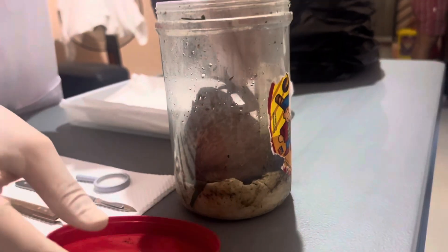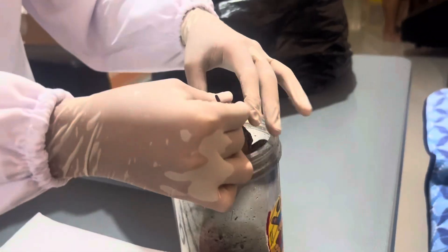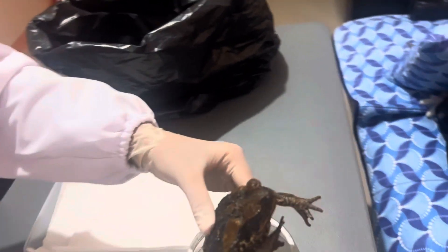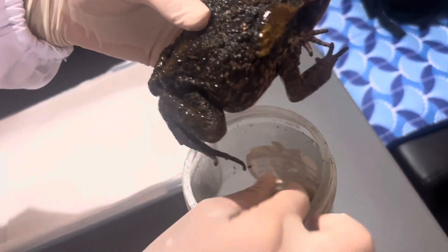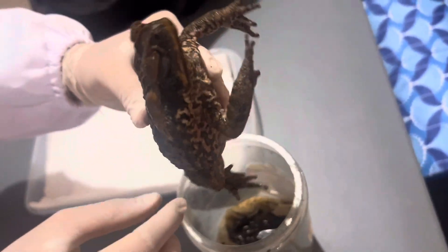In order to make the toad unconscious and dizzy, we poured alcohol. Meanwhile, there were hilarious moments as we continued to pour the alcohol, and we are going to show those hilarious moments in the last part of our video.